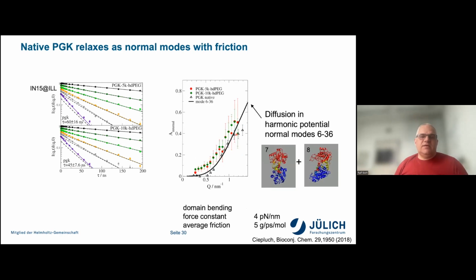But we want to look at domain motions here, and the black line now shows the previous results again, with more modes to calculate this, and there we get a good description of our motions. If you compare this with our red and green points here, one could first think one could just scale the amplitudes up. But if we do that, the protein structure would explode. So it's not just larger domain movements that we observe here.